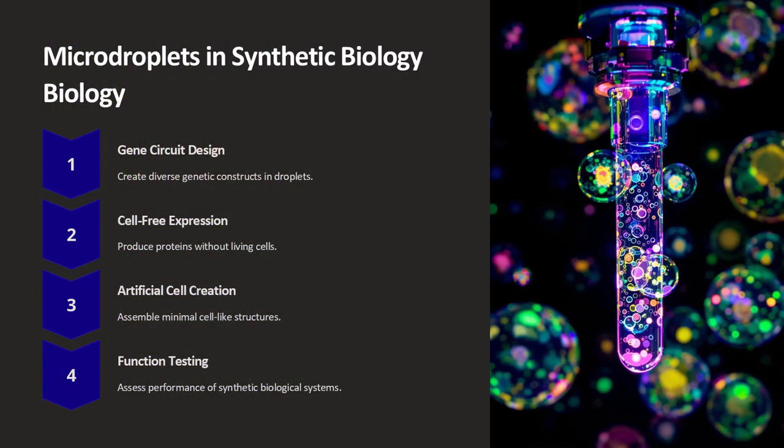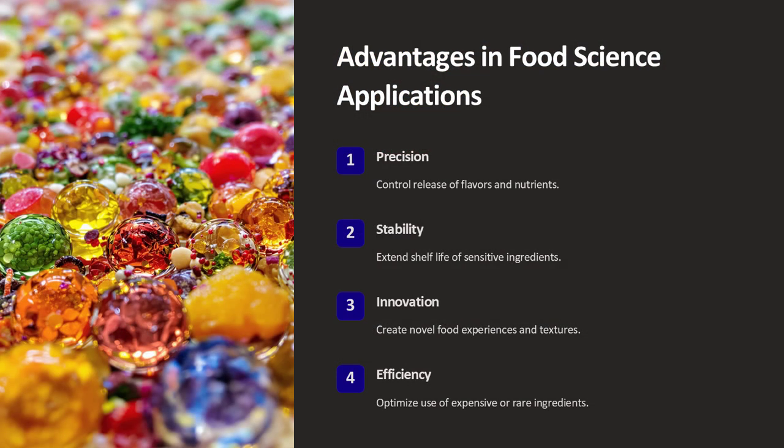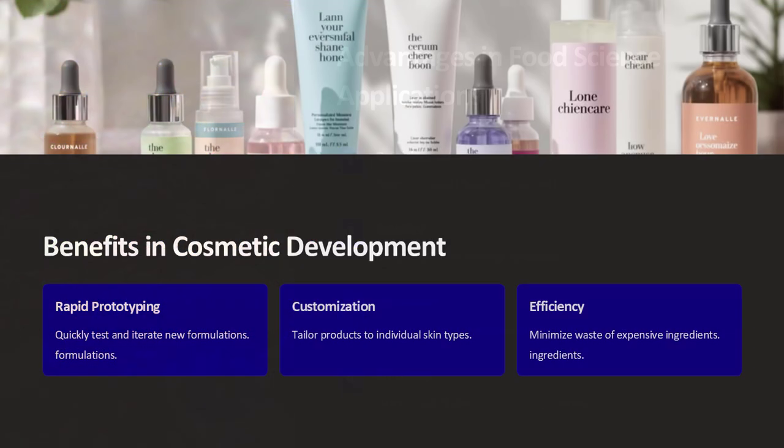For instance, by using techniques such as pico-injection, additional reagents can be added to pre-formed droplets at specific time intervals, allowing for multi-step reactions to occur within a single droplet. This sequential addition of reagents is analogous to following a multi-stage recipe, where each step is carefully timed and executed to achieve the perfect final dish. Such dynamic control over reaction conditions is crucial for exploring complex chemical spaces where the outcome depends on precise timing and concentration profiles.